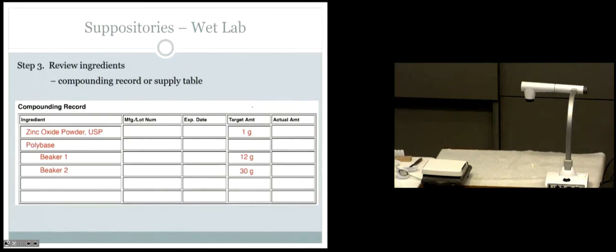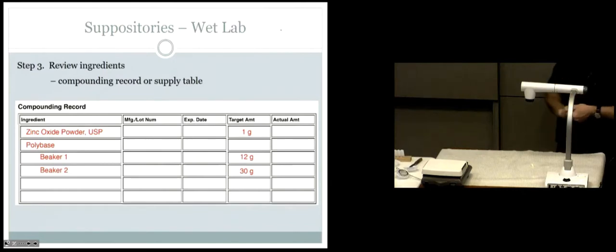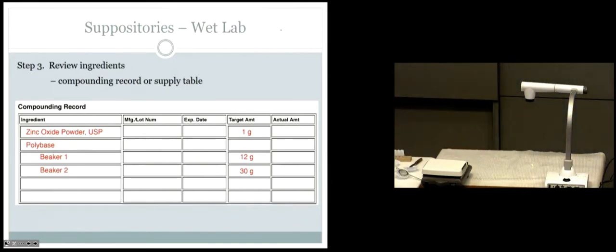Let's go ahead and fill out your compounding record, though, since we've just done those. You can go ahead and fill that out. It should look like this. This is the best way to write it out. You can fill in the manufacturer and lot and all of that. But you're going to have 1 entry for zinc oxide powder. We said our target amount is 1 gram. For polybase, there's going to be 2 beakers. Beaker 1 with 12 grams and beaker 2 with 30 grams. Got that?